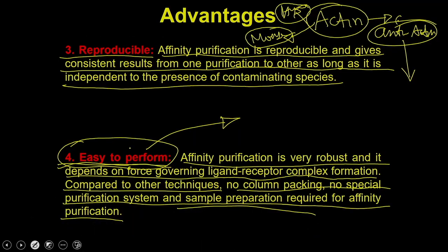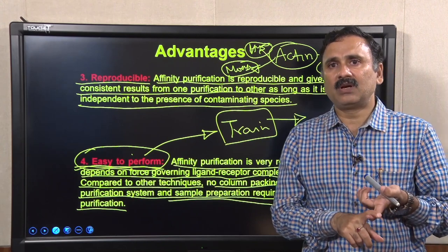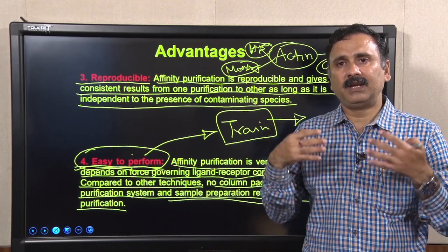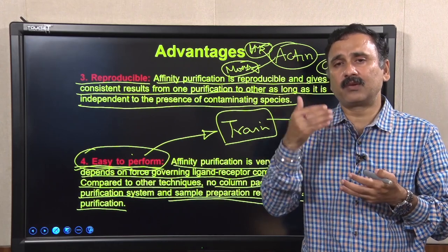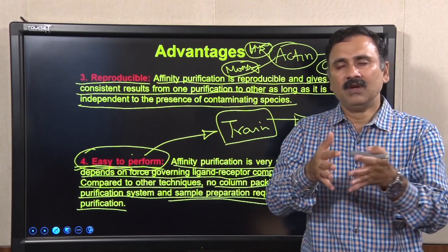And because it is easy to perform, you don't need to train the people, which means affinity chromatography is going to save your time to train the manpower to learn the technique. Whereas in all other chromatography techniques, be it ion exchange chromatography, hydrophobic interaction chromatography or gel filtration chromatography, the person has to know the molecular properties and how to exploit those molecular properties, how to set up the gradient, whether I should use the step gradient or the linear gradient, and so on.